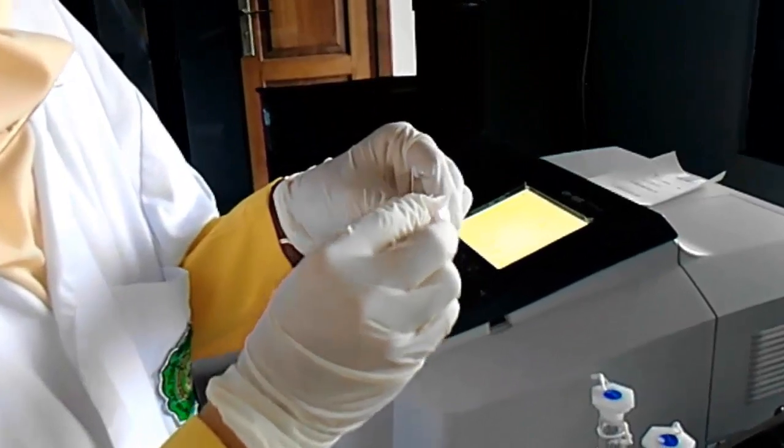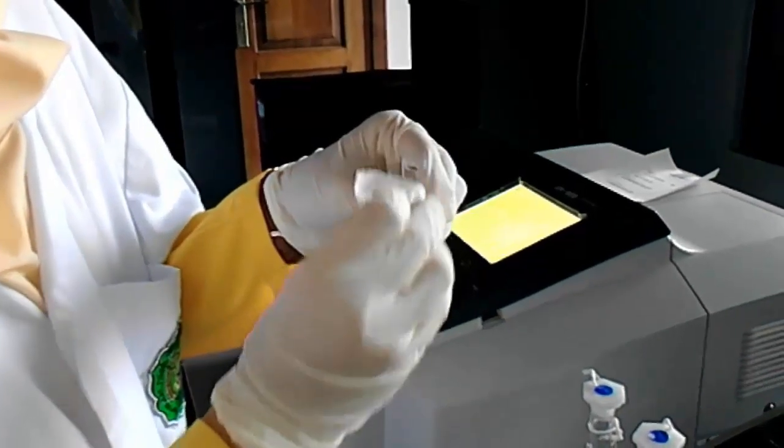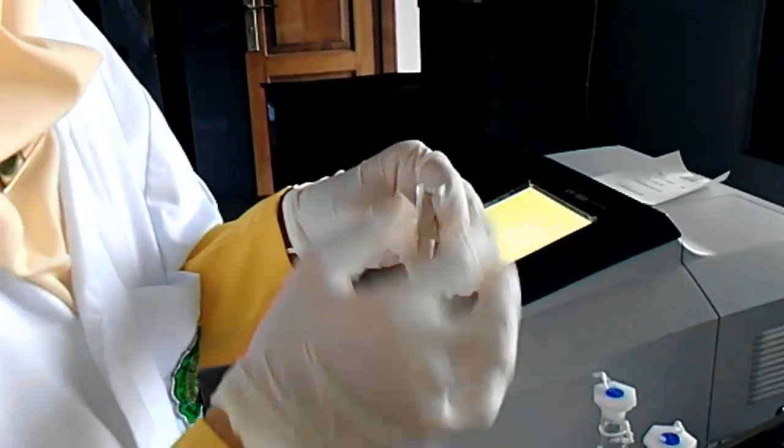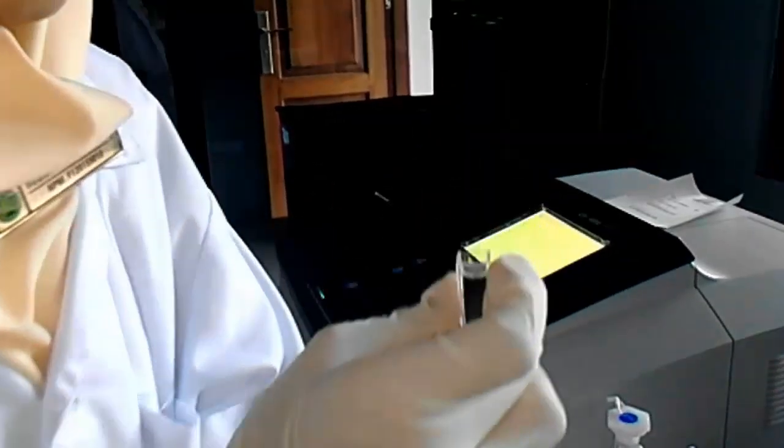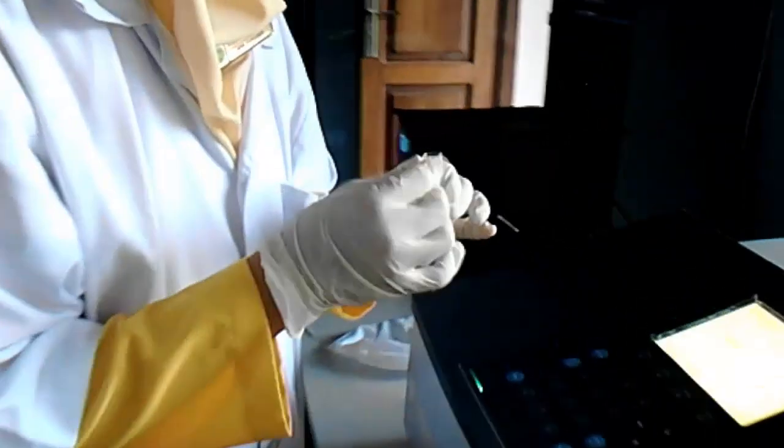Wipe the clear side of the cuvette with tissue. And put the cuvette in the measure slot in the spectrophotometer.